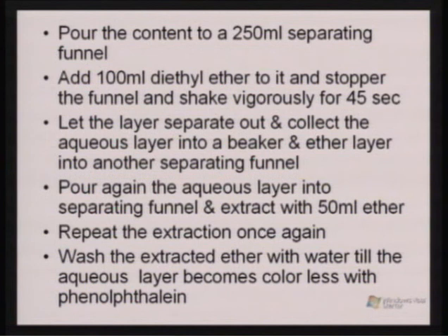Combine all the ether extracts into a separating funnel and then wash the ether extract with water till the aqueous layer becomes colorless with phenolphthalein. After combining all the 3 or 4 extracted ethers, wash this with 50 ml of water 3 or maybe 4 times to make it colorless if you are checking with phenolphthalein.